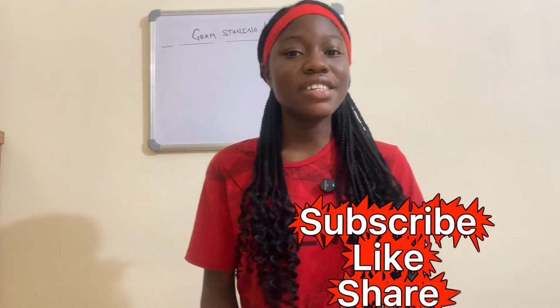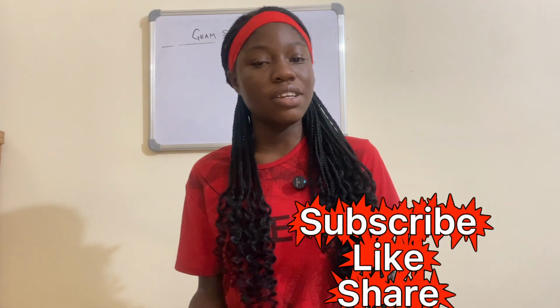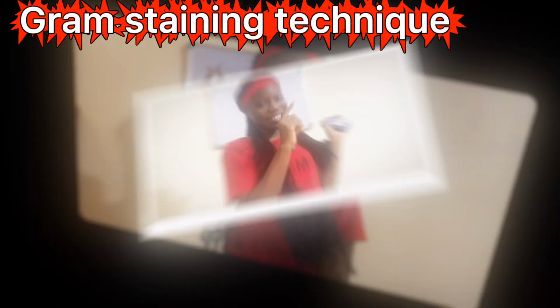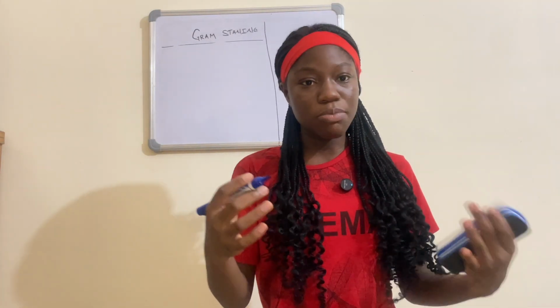So, in today's lesson, we are going to be talking about gram staining technique, the importance of gram staining, what is gram staining, and why the bacteria appear different in color after gram staining. So, let's get started. Gram staining technique is a technique that is used in the microbiology lab to be able to differentiate between microorganisms, right?